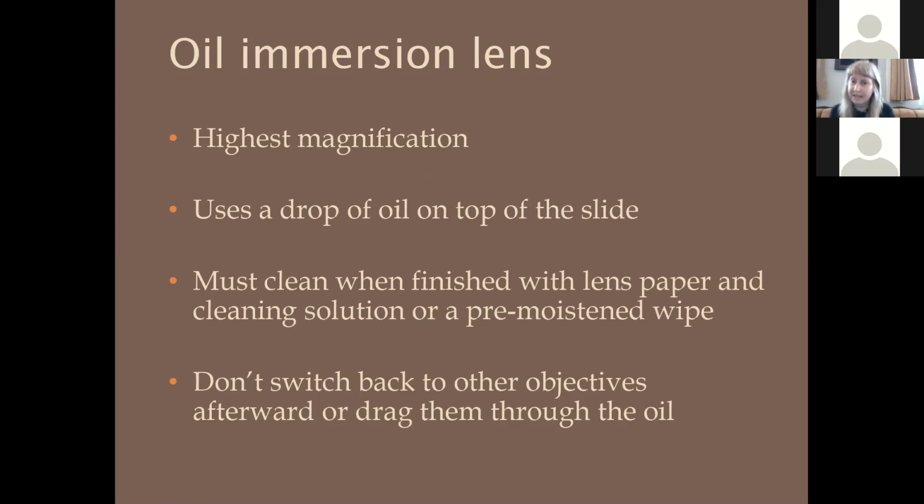Okay, so Elena asks, what should we budget for a decent microscope? So I bought the Amscope B120C, and I'm going to write that into the chat. B120C.